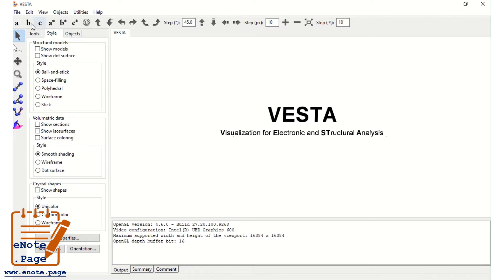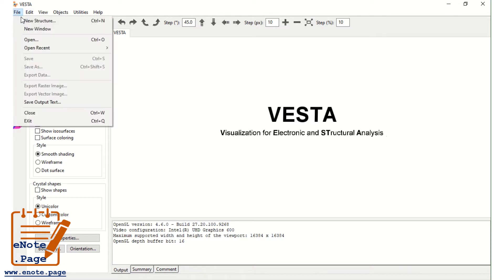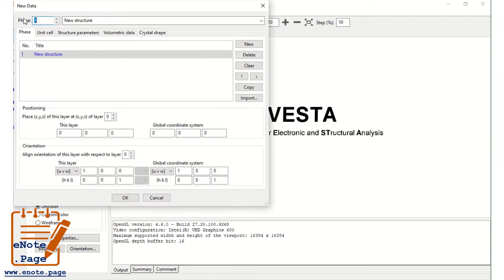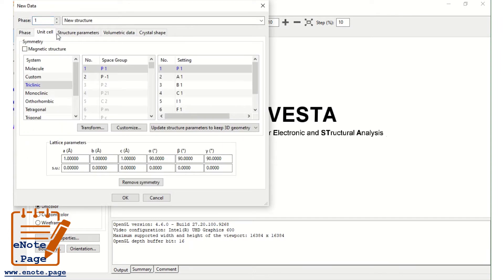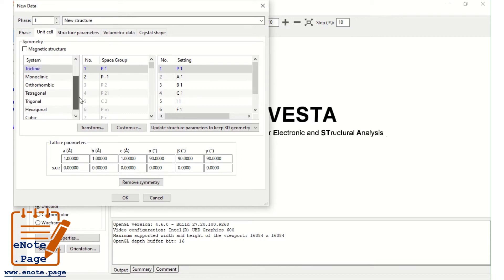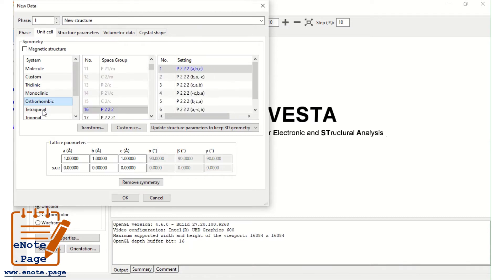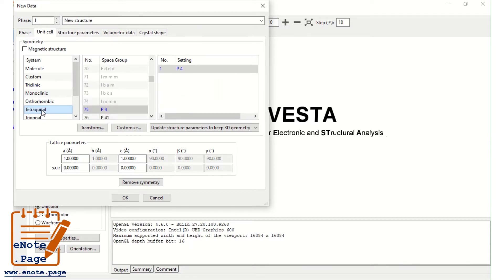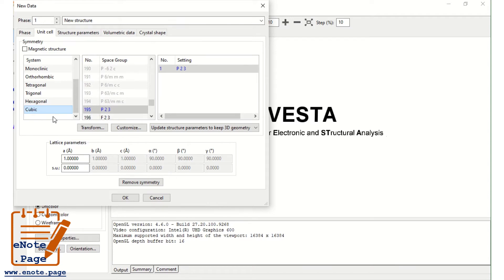First, go to File > New Structure, and then take the unit cell. We are having seven types of crystal systems: triclinic, monoclinic, orthorhombic, tetragonal, trigonal, hexagonal, and cubic. Just for simplicity, let us start with cubic.